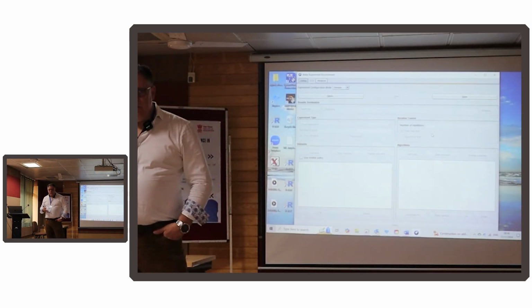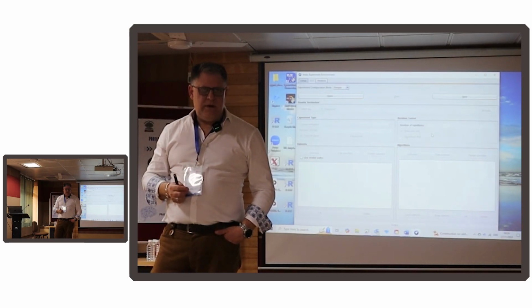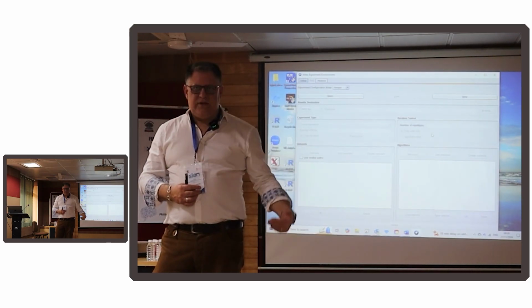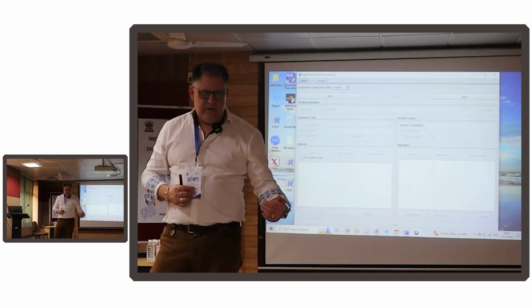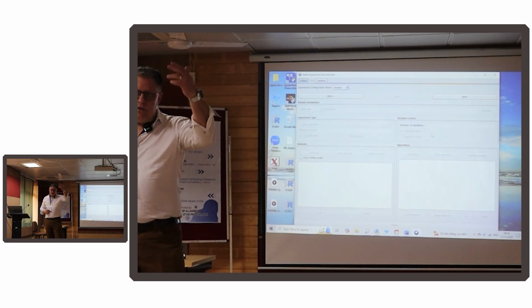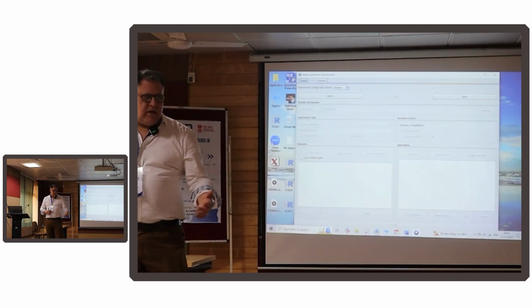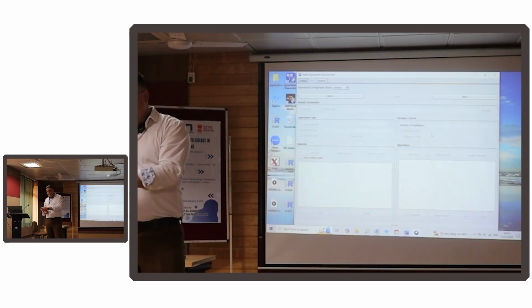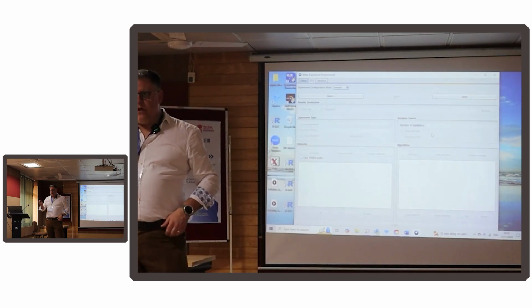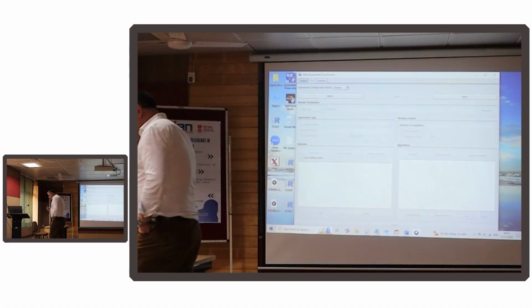It will allow you to do things like trying out 2 different algorithms on, let's say, like the files I have, 20 different files of mass spec values, answering a particular question. It will allow you to evaluate those algorithms on each one of those features, and it will give you the results in an Excel spreadsheet at the end of it. So you can kick out the results as a report, which is in a spreadsheet. Let me show you how to do that.